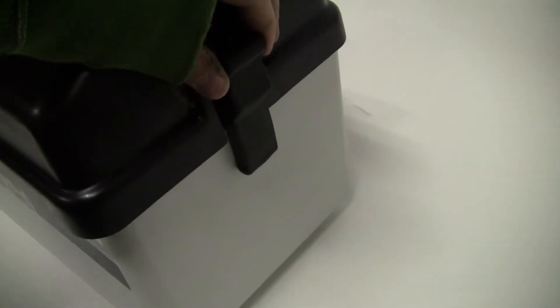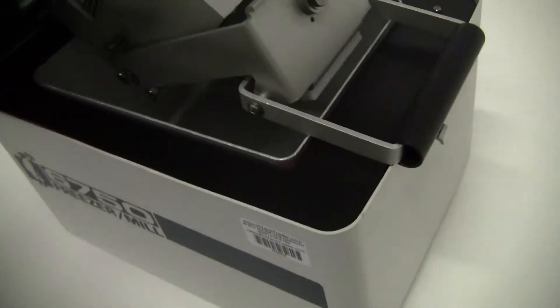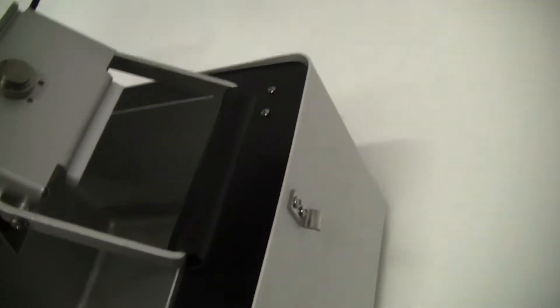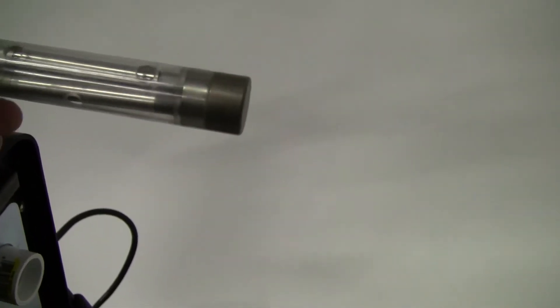We do not have it here in house. Take a look at the inside — very clean. Here is your sample container.